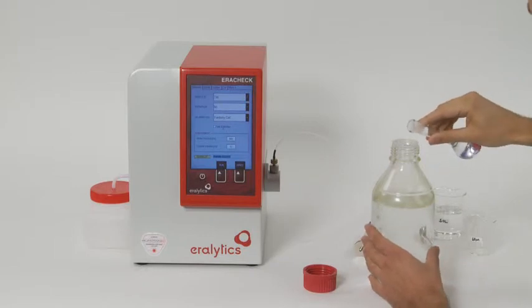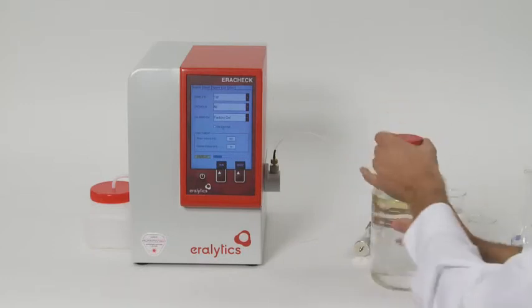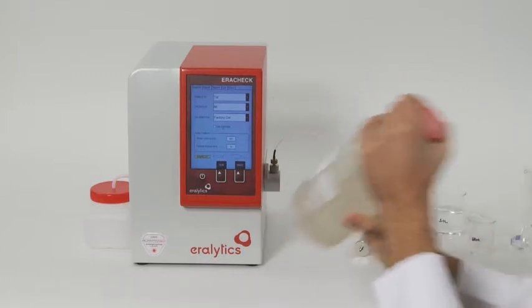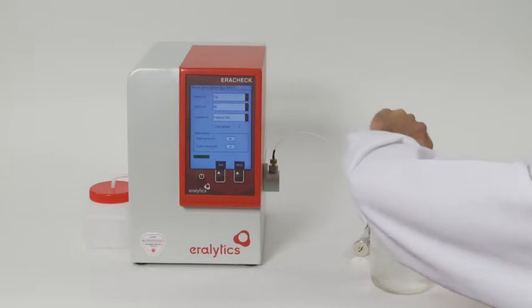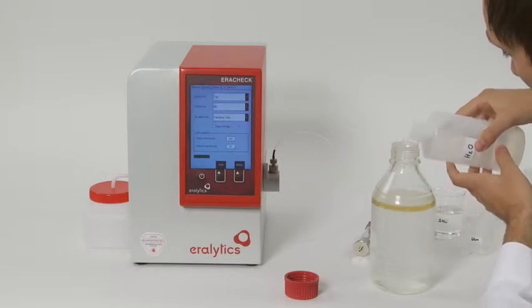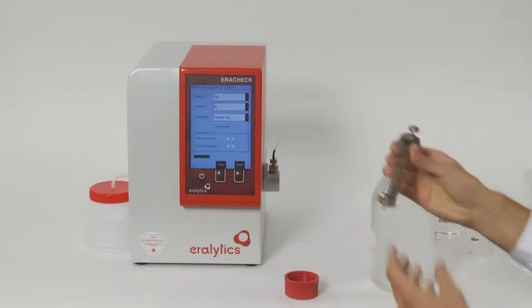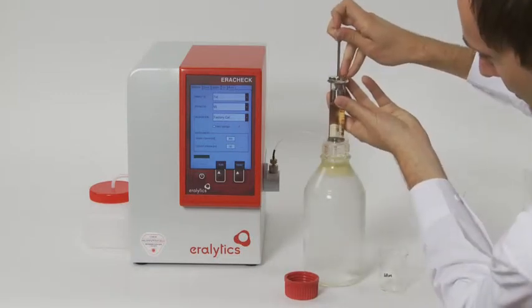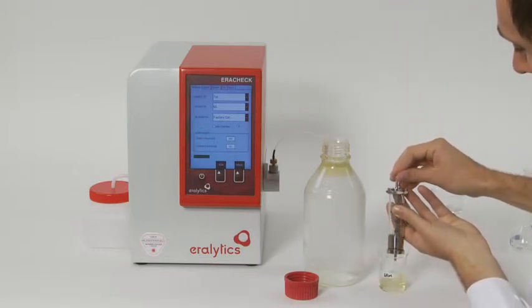Pour the solvent into the sample bottle and shake the bottle vigorously for a good extraction, then wait until the phase separation has completed. Now the hydrocarbons previously present in the water sample are concentrated in the solvent phase. Add some tap water to the sample bottle to lift the solvent phase to the top of the bottle.